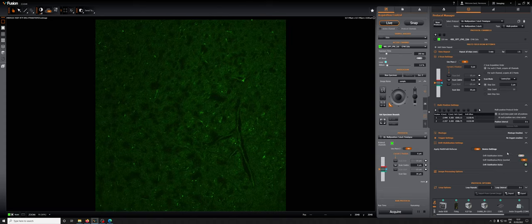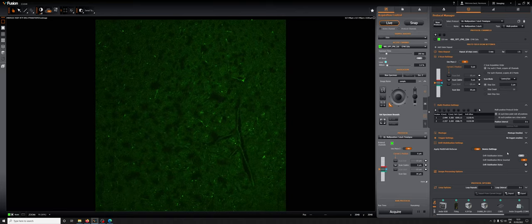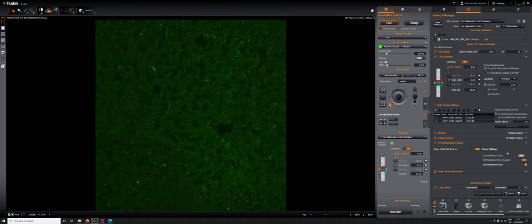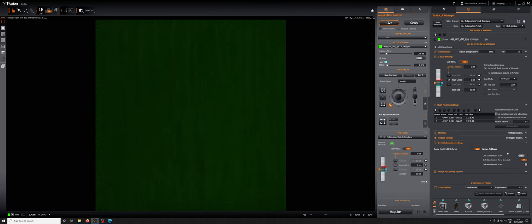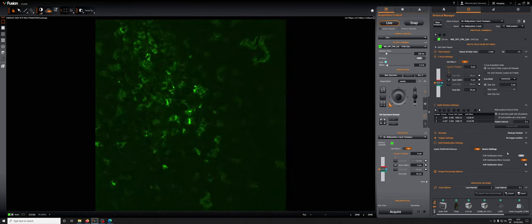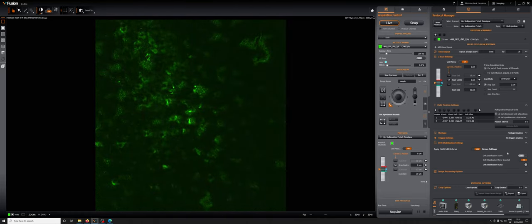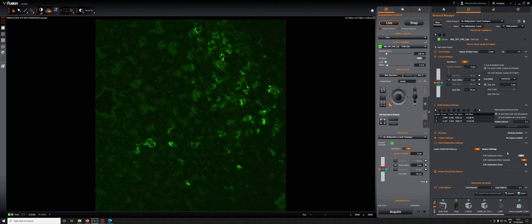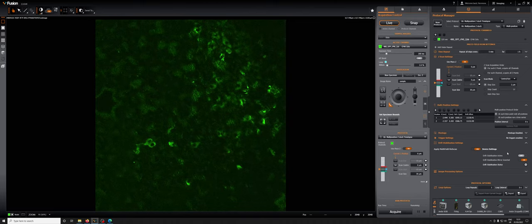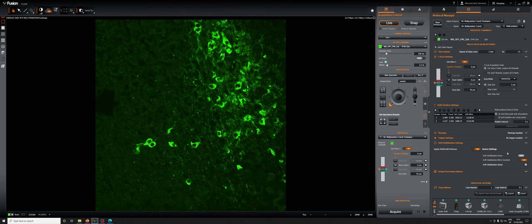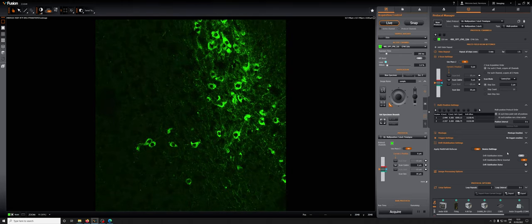Now I can move. I'll do this one more time. We're going to go maybe north and then east. I'm going to go here. Again, I'm going to focus by using the focus knob on the microscope. I like that focus.